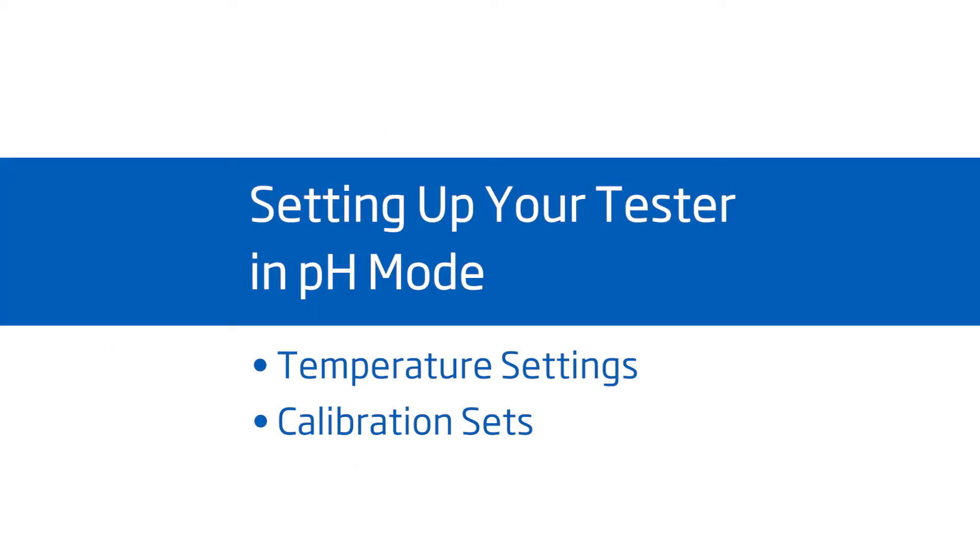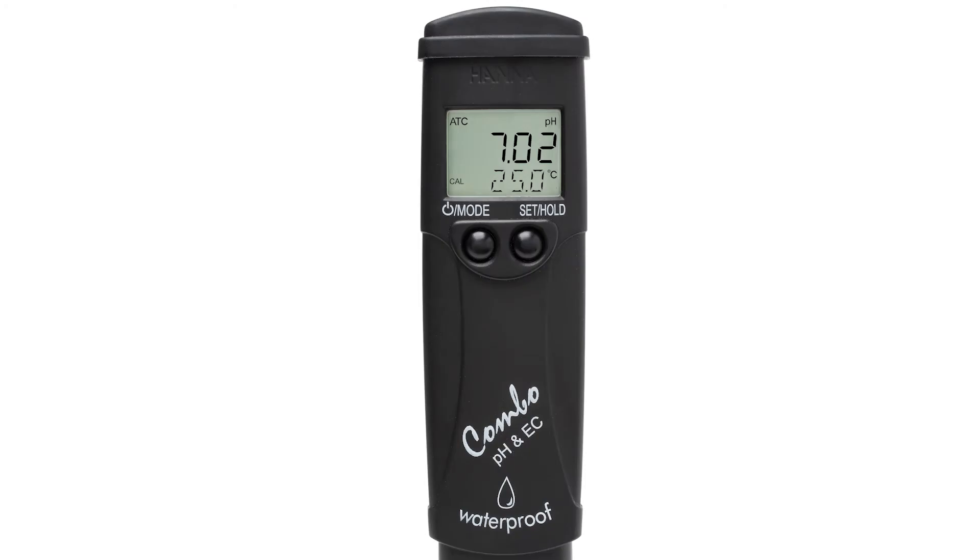To set up your tester, when you first turn it on, you'll see pH and default temperature settings at the bottom of the screen. To change temperature settings, press and hold the MODE button for six seconds until temp shows on your screen. By pressing the SET HOLD button, you'll see the temperature units change from Celsius to Fahrenheit.